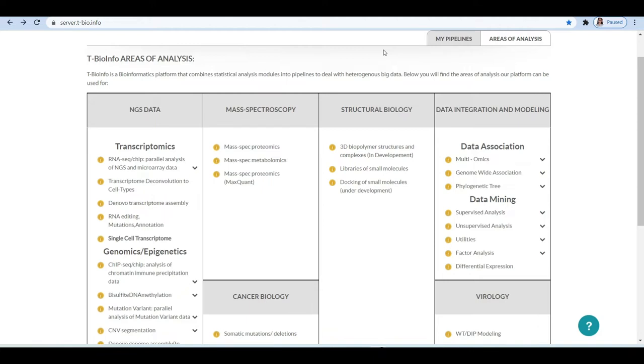Depending on whether the data is normalized or not, these methods can be applied. For instance, if data follows normal distribution, we can use various types of t-test methods, including Welch method, Wilcoxon, etc.